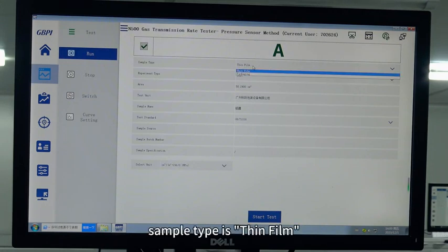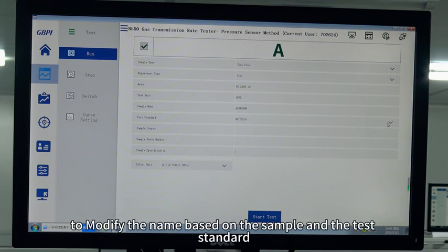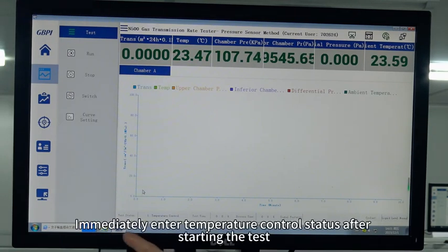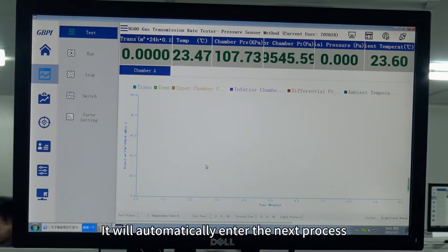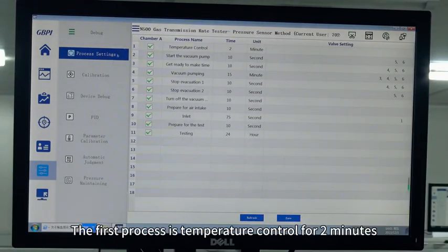The sample type is thin film, experiment type is test, and the area is fixed at 50 cm². Modify the name based on the sample and the test standard. After starting the test, it will immediately enter temperature control status. When the temperature control reaches our set value, it will automatically enter the next process. All content of the testing interface is controlled by process settings.